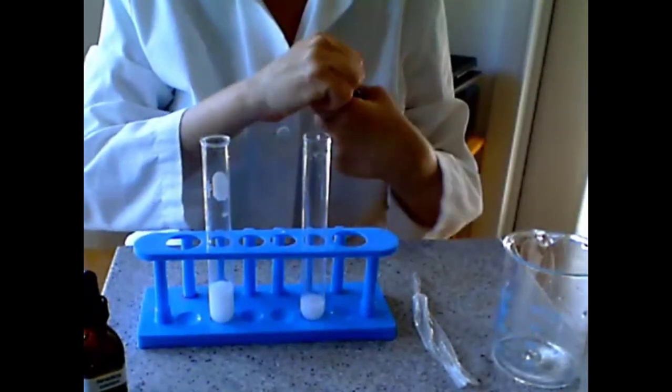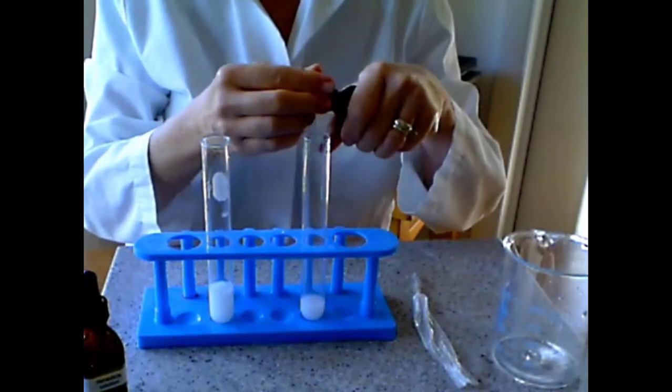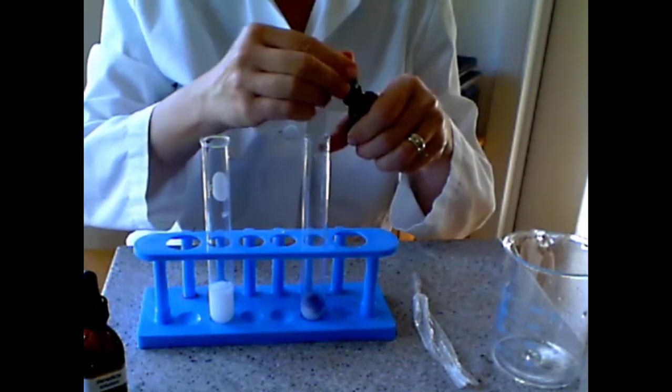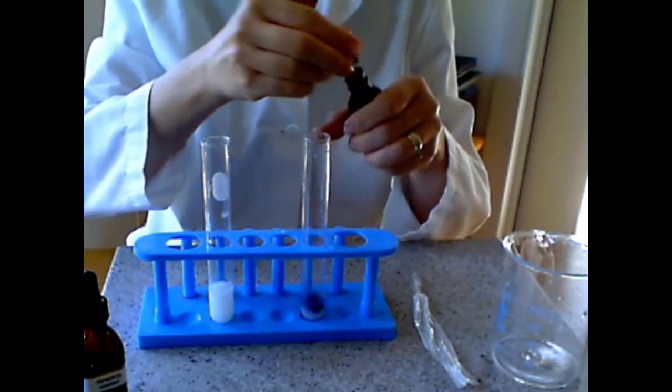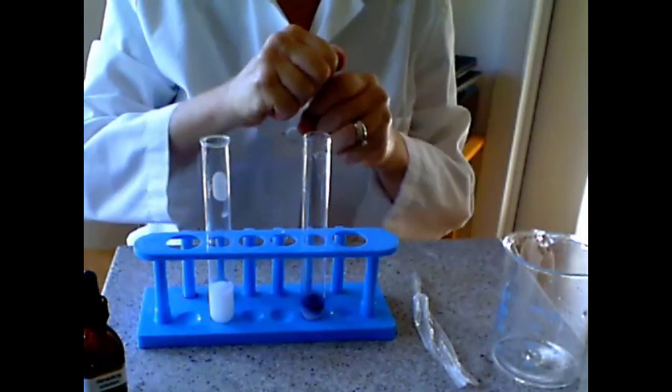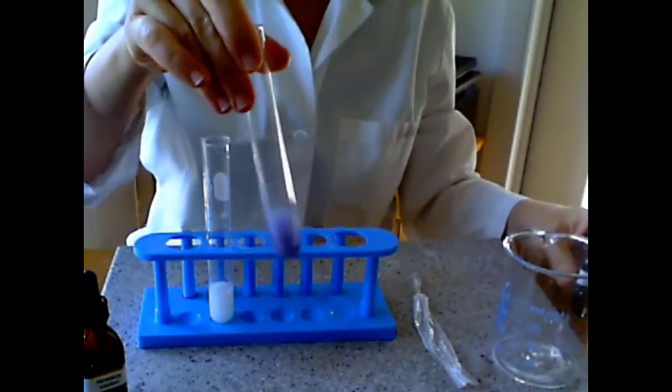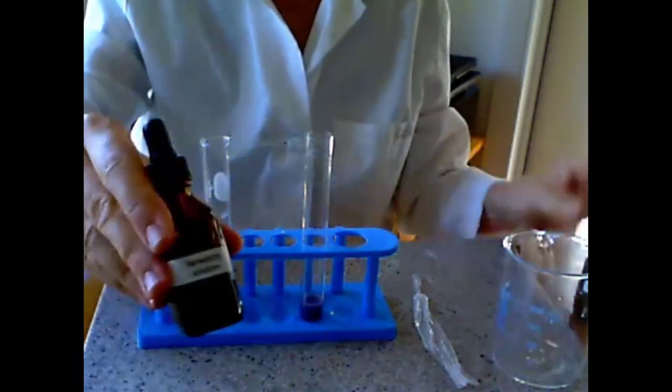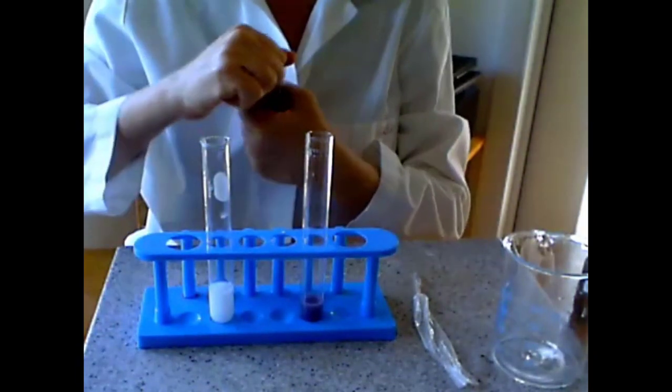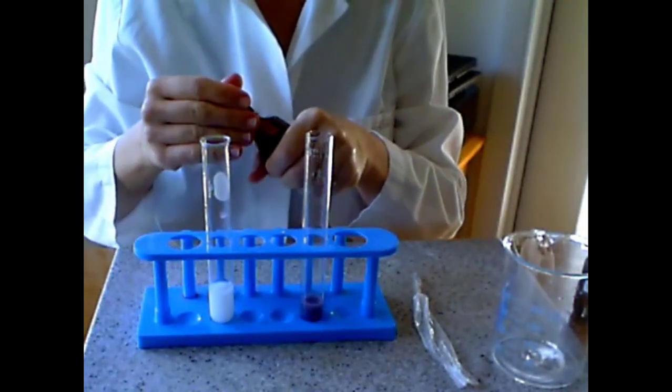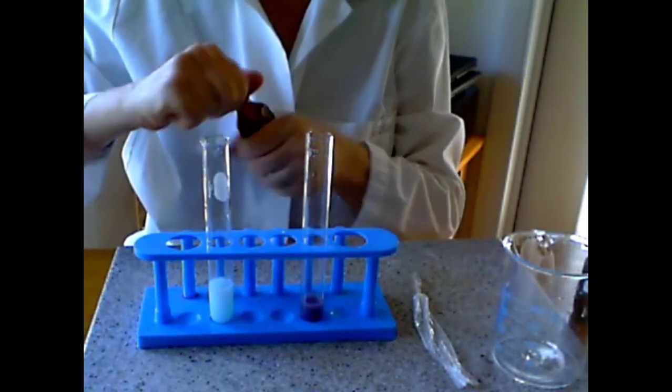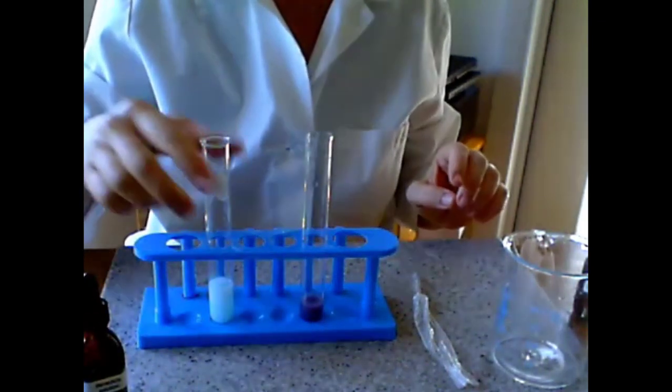We will add IKI, or iodine, in the first tube. Notice the color inside of the tube now. And now we are going to add Benedict's to the second tube. And we are going to take this tube to heat for three minutes.